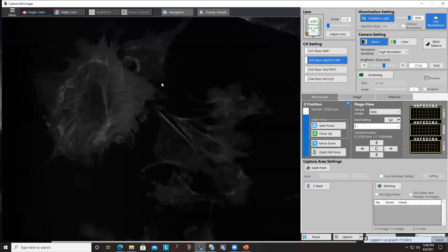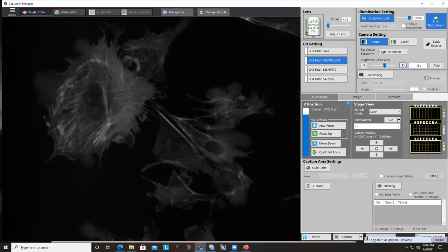I guess this is a good cell to look at. So just one quick question. For the same cover slip, say for example, like we are now looking at, under the same cover slip, and we are looking at different locations of the sample. I do see one area is dim and one area is bright under the same cover slip. Can I use different resolution for that part, or should it be constant for all the areas I'm exposing? You should be constant for all the areas that you are exposing.